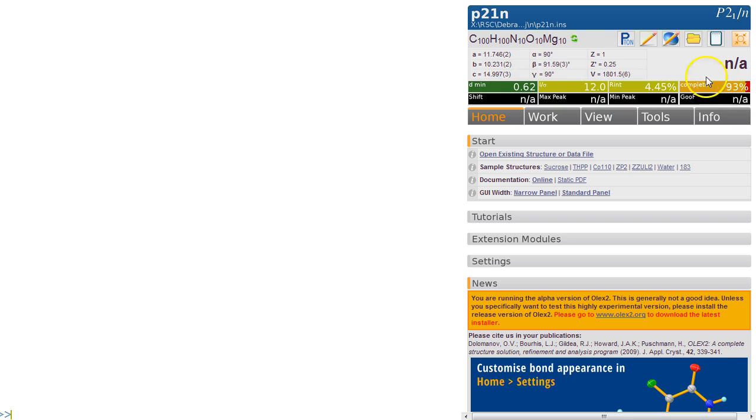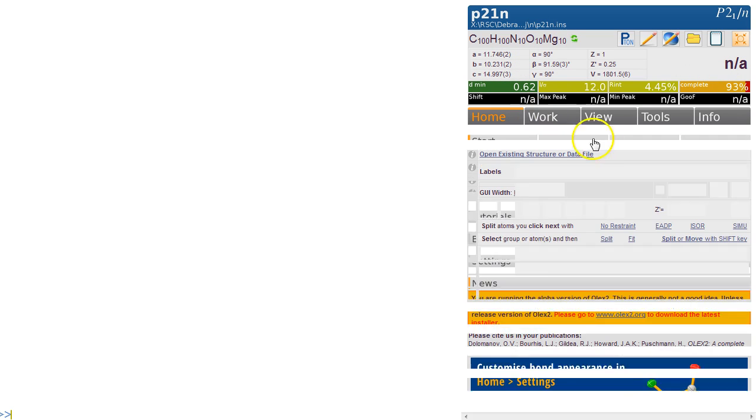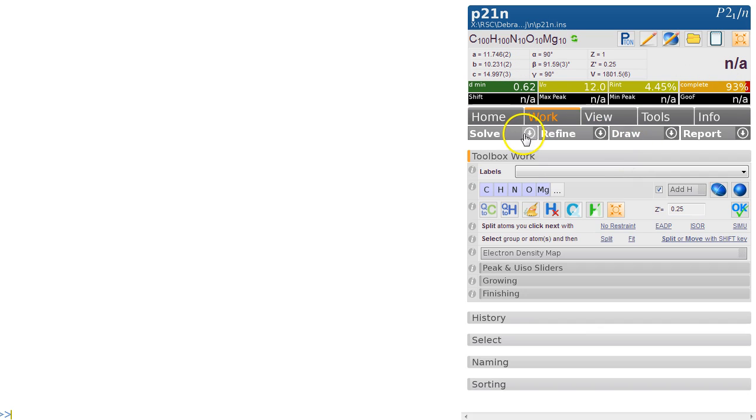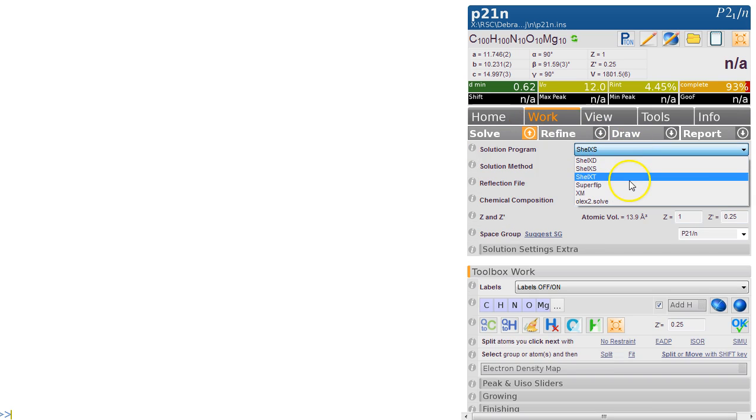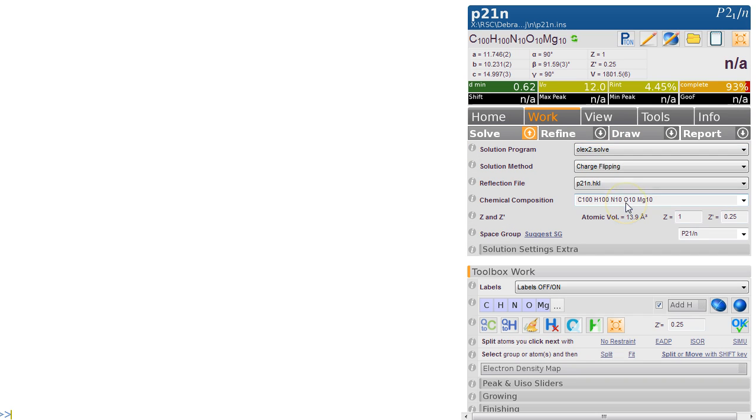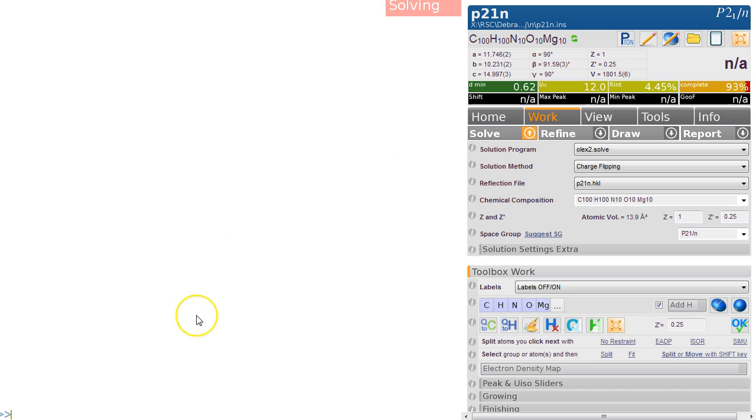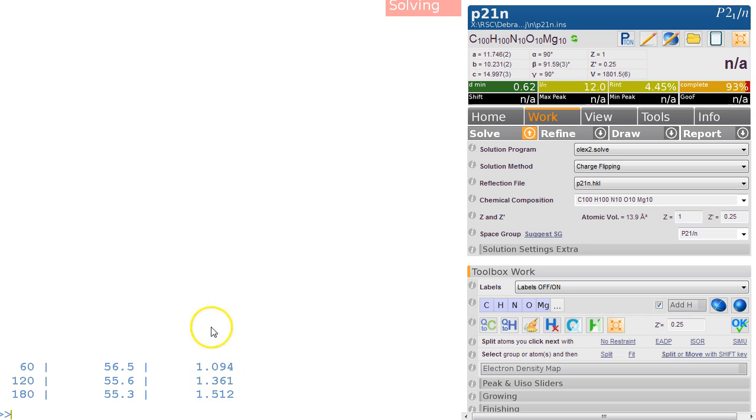very good data, we've got a cell—that looks great. So let's solve it. Olex2 solve, we can try Superflip. Olex2 solve, let's stick with Olex2 solve for the moment and we hit solve. It will take a little bit of time to run and here's the output. What you're looking for is this number which should become bigger and bigger.